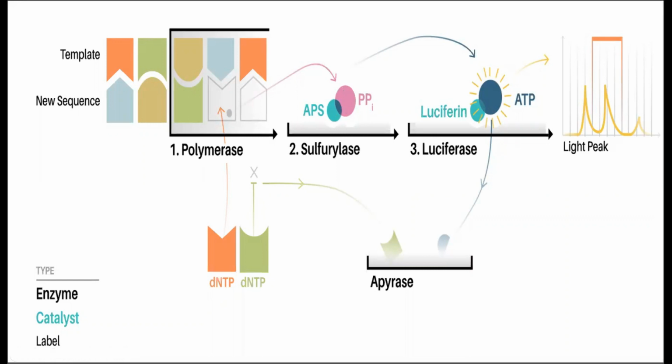Now if you wash your device or instrument, your DNA wouldn't wash off, right? Only those DNA would wash off that are not able to bind. So your bound DNA won't wash off. Now once you are bound with the DNA, then you can go for the next thing. Once your DNA is fixed on the surface, then we transfer this bead plus our target DNA onto a well.